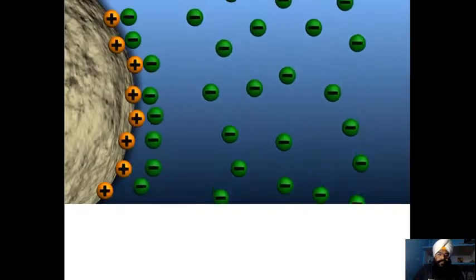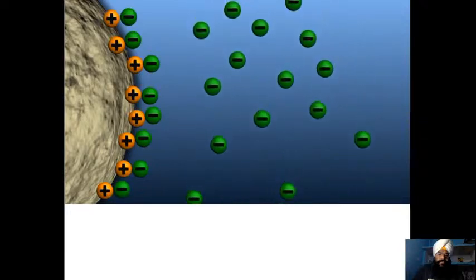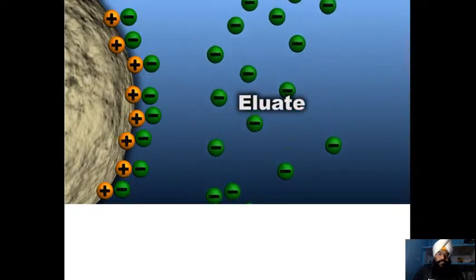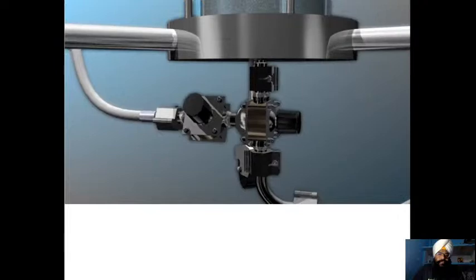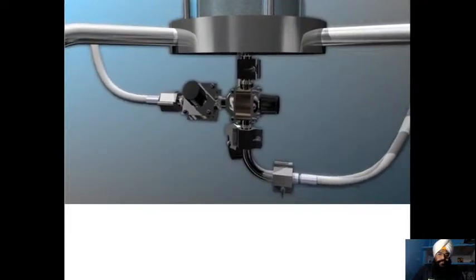As the new buffer is pumped through the beads, at some point the GFP no longer binds to the beads and is released into the buffer. The resulting product stream is usually referred to as the eluate. The UV optical density sensor, which measures protein concentration, indicates when product begins eluting from the column. At this point, outlet valves are switched to allow flow of the eluate, the product stream, to a collection vessel.